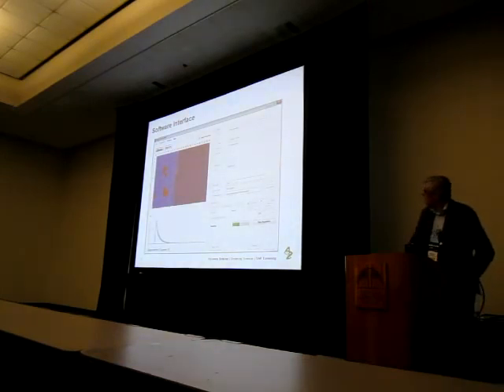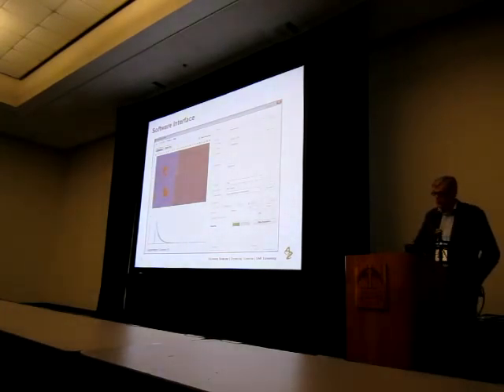In terms of the information on the panel to the right, this is where you put in the information about the protocol. The system will give the plate a time and date stamp and a unique identifier. Obviously, if it's got a barcode on the plate and it's integrated with the barcode reader, then that's where you'd expect to find the barcode.